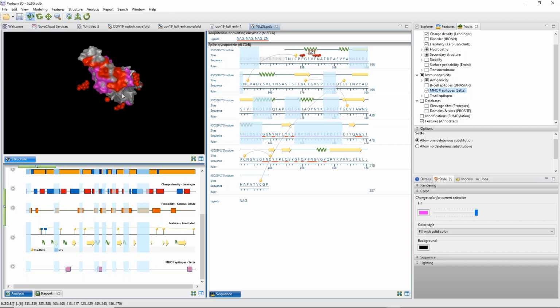So how about, okay, let's see. We'll start here. What if the protein structure is not defined in the PDB? How can you use protein 3D if there's no structure? So if there's no structure, what we're going to have to do is really utilize that hybrid template ab initio modeling approach.